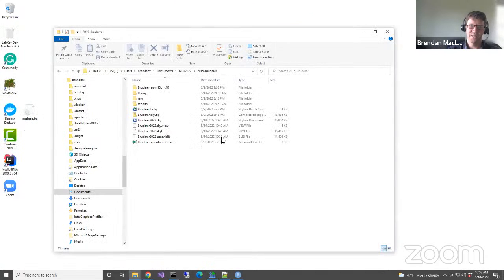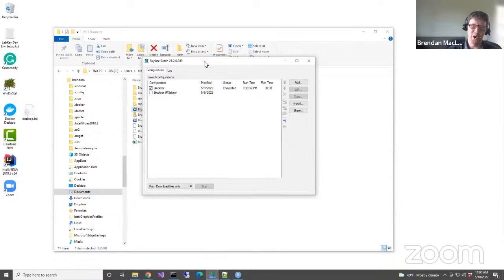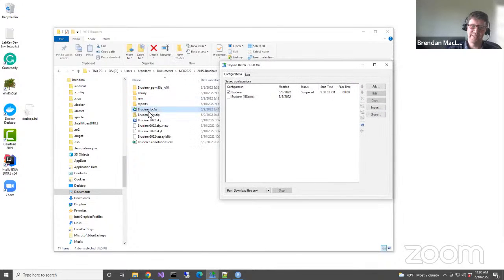So let's go back to the machine where we were working, and I'm going to delete this one. Well, no, I'll just create another one. I don't need to see it. So here is what Skyline Batch looks like when you've opened the Bruderer BCFG off the website, and this points to everything on the website.